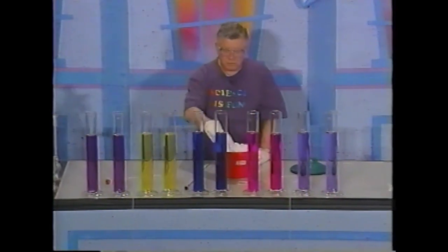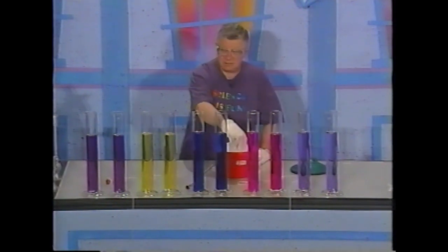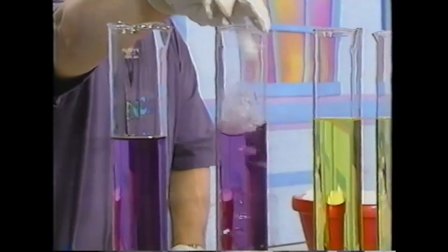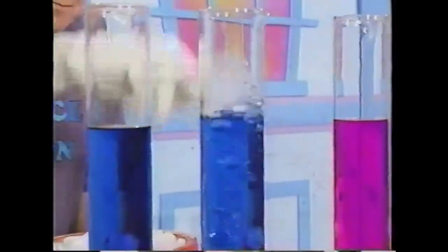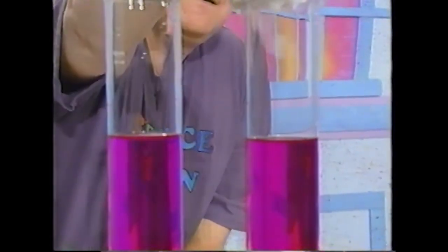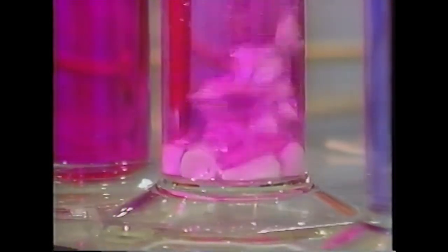And what I'm going to do is take chunks of dry ice and drop them into these cylinders in a very special way. And when I get done, you tell me what that special way is. So here we go. You see any bubbles? What kind of bubbles are those? They're gas bubbles. What kind of gas? Carbon dioxide. Where's the carbon dioxide coming from? It's coming from the sublimation of the dry ice.